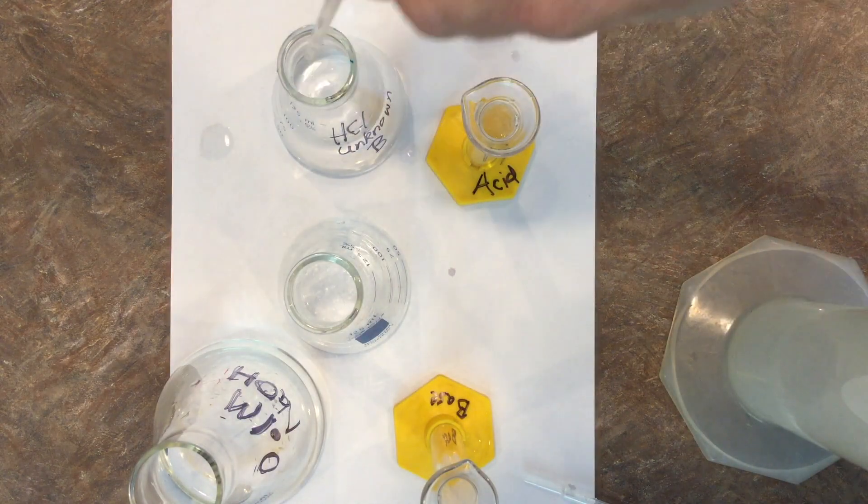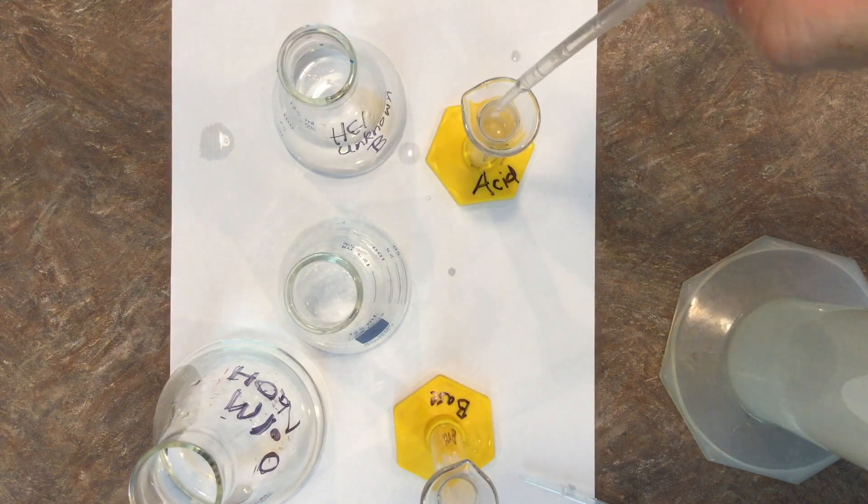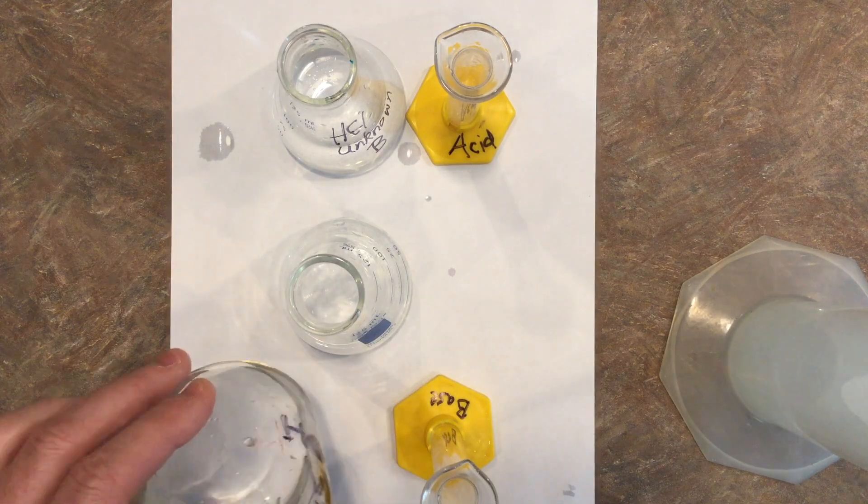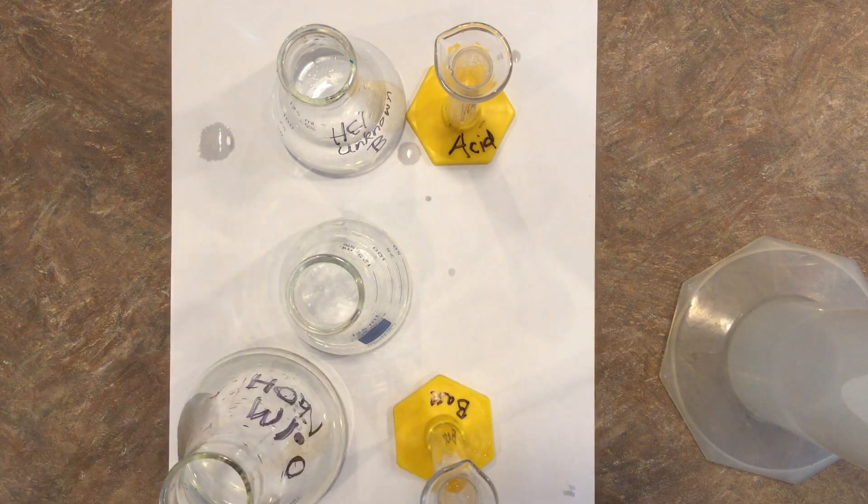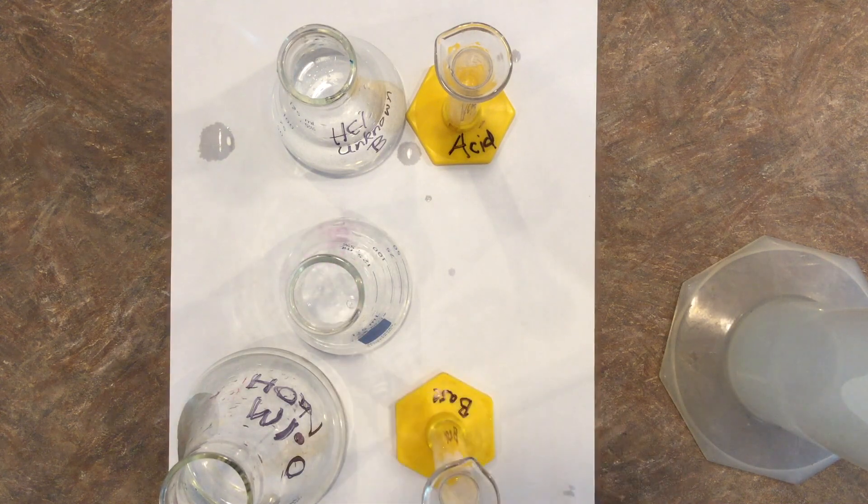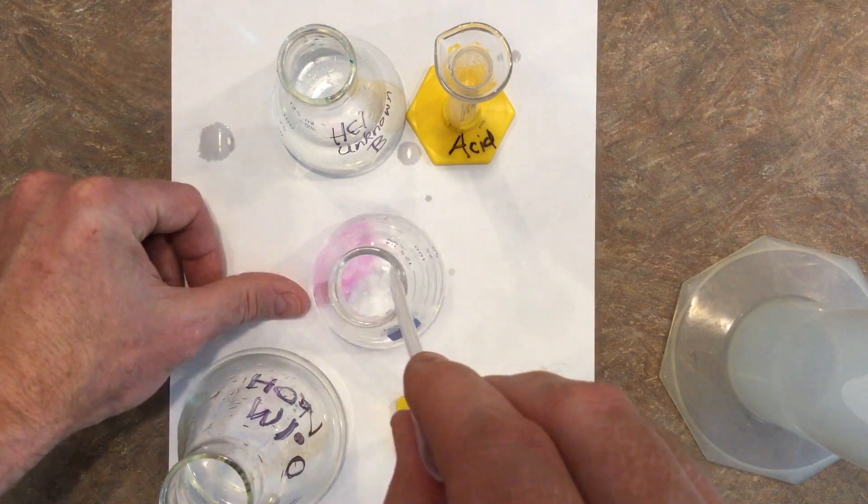And now on to unknown B. We'll start by measuring out 10 milliliters and put it into the empty Erlenmeyer flask. Then I'll get 10 milliliters of my 0.1 molar NaOH and put it in that graduated cylinder. Now I'll slowly start adding them and look for the color change. I don't want to go past that point.